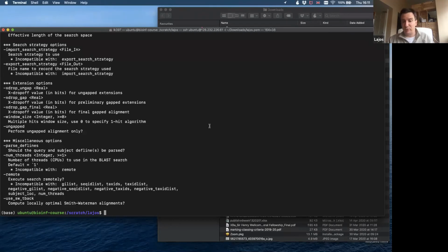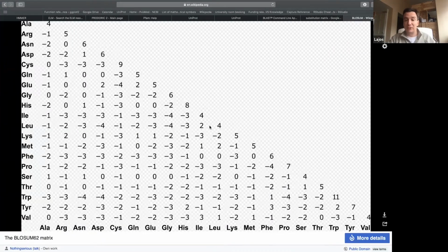Start looking for protein homologues first with BLASTP, because you will have a much higher chance to find something. But even BLAST has its limits, because everything is based on a very general substitution matrix. This is a hugely simplified matrix compared to the complexity of biology.